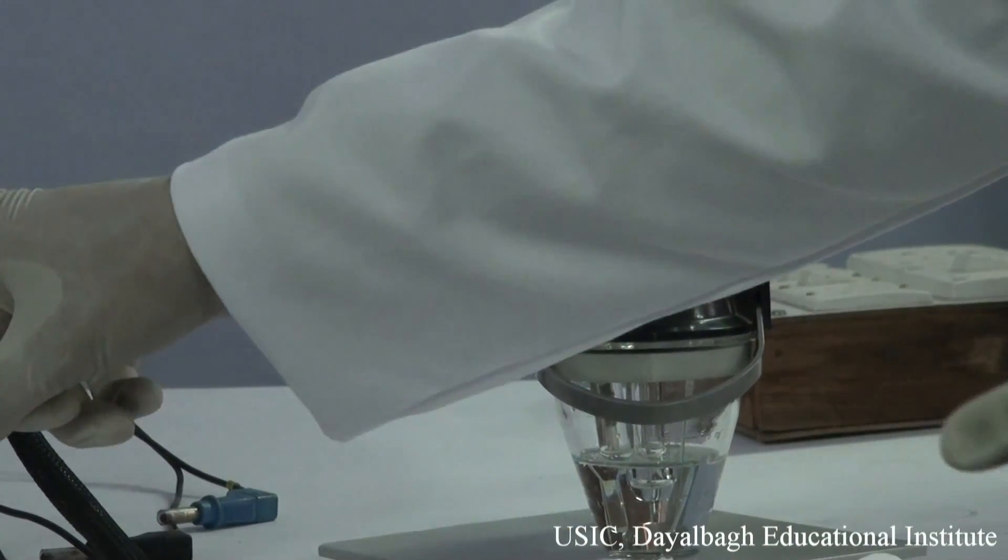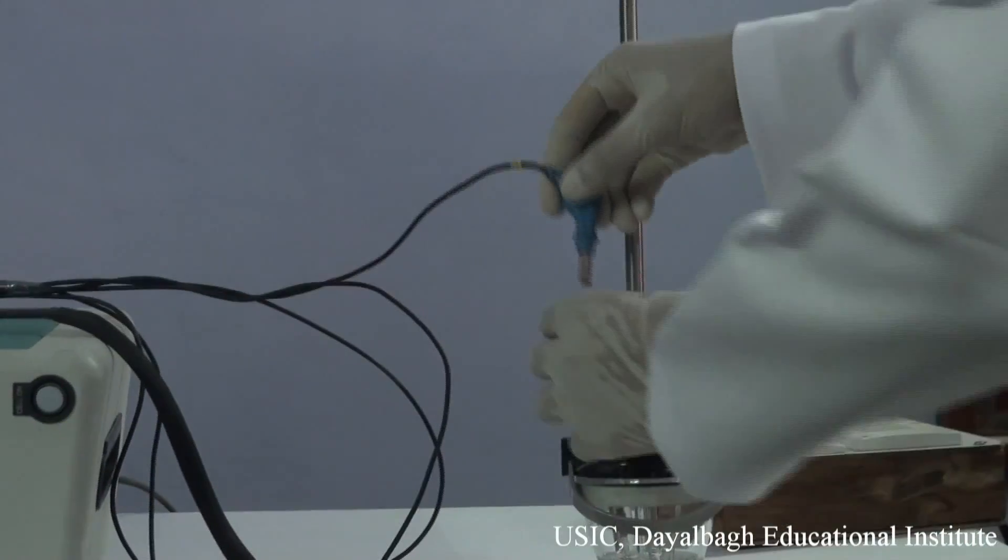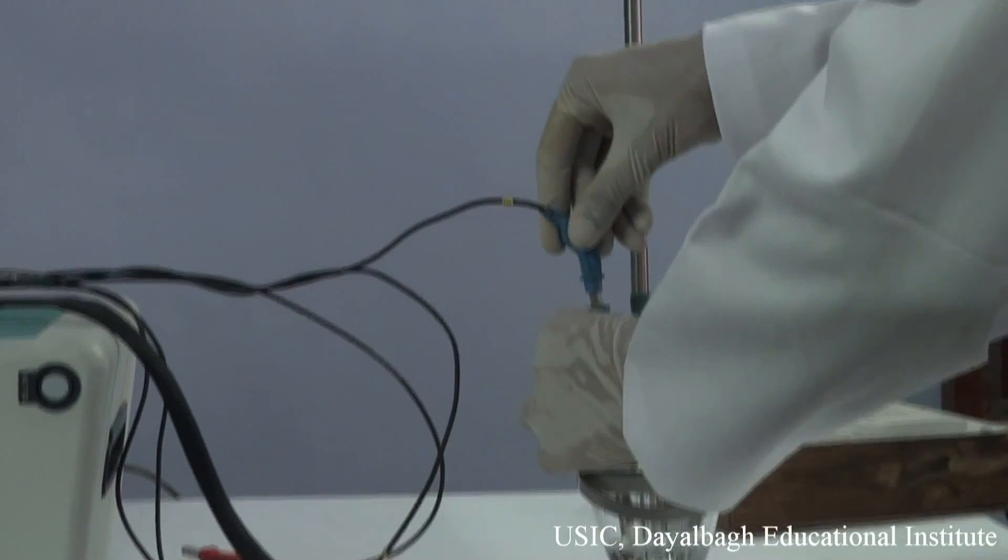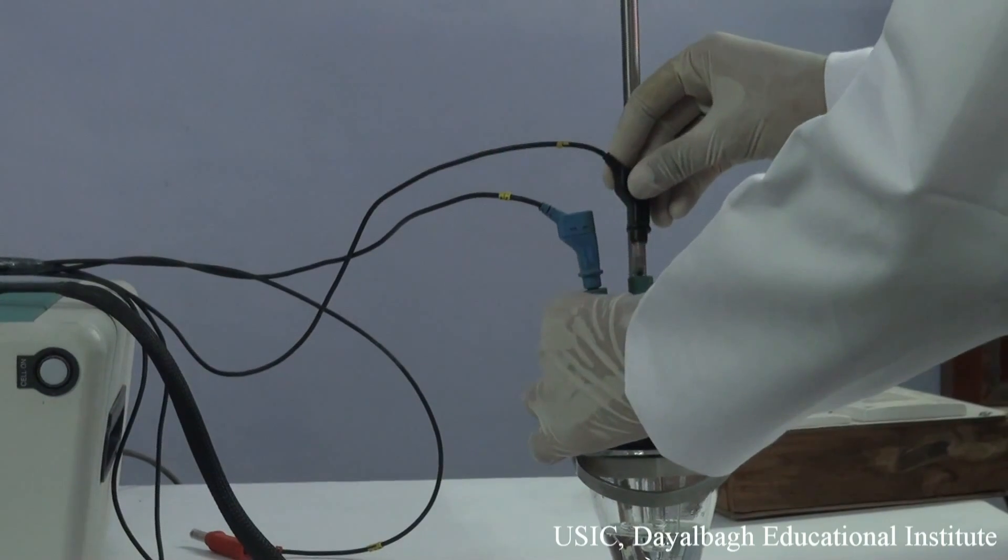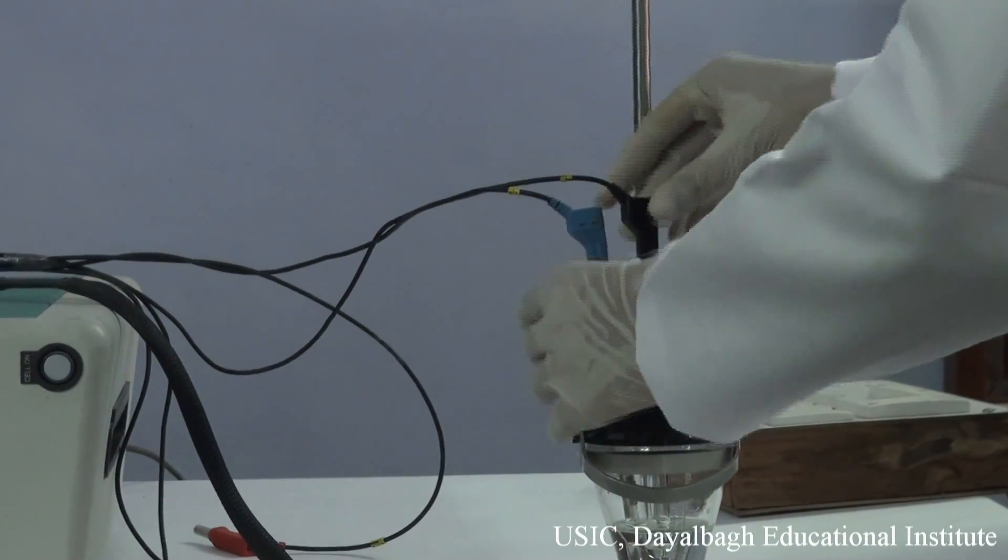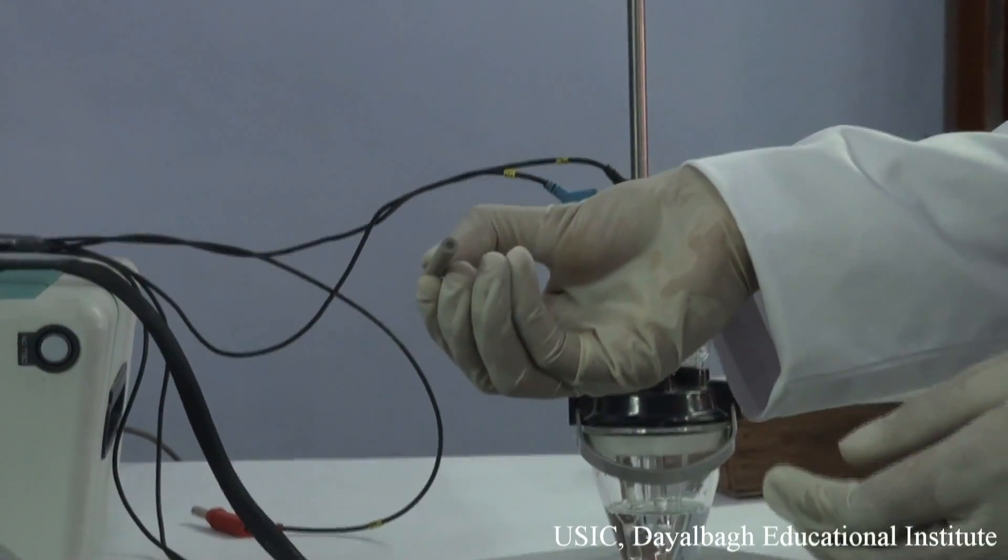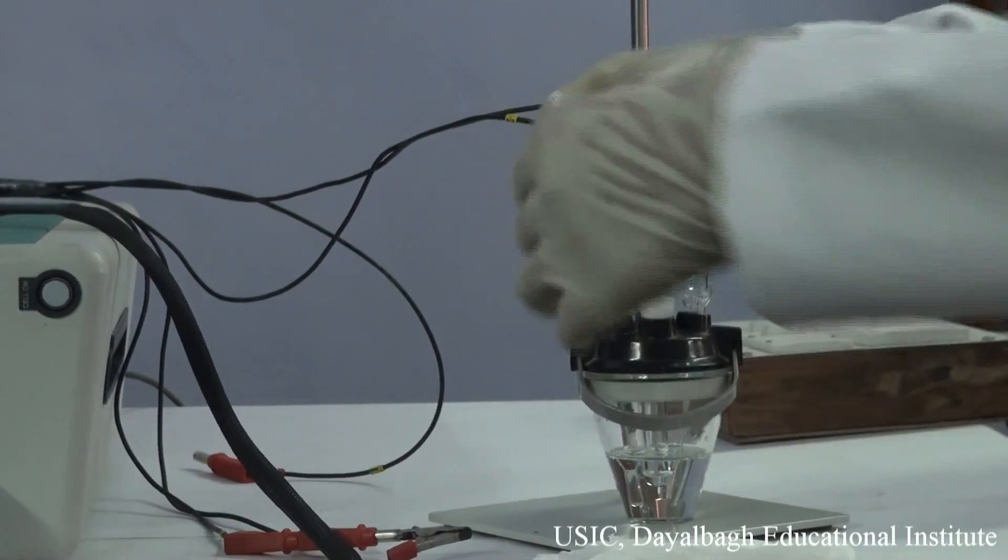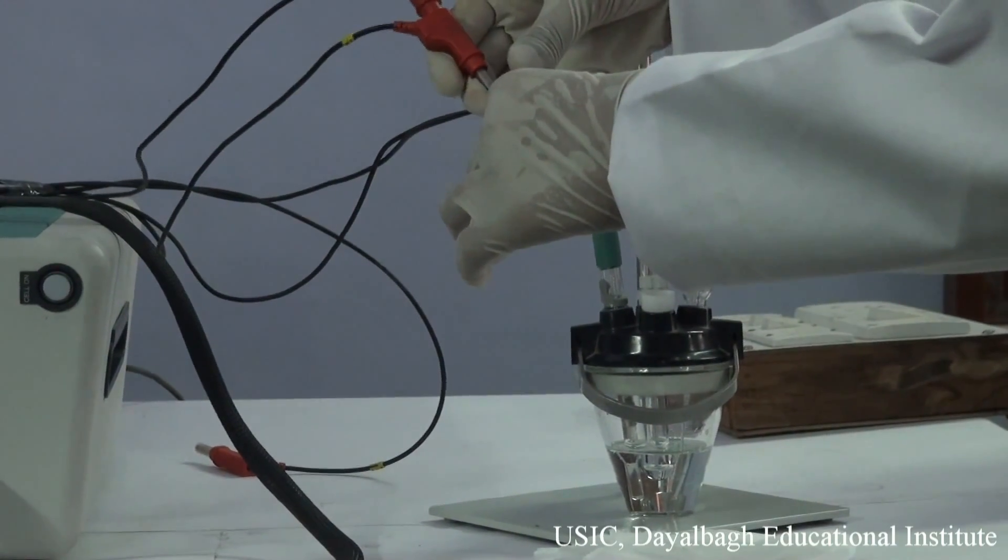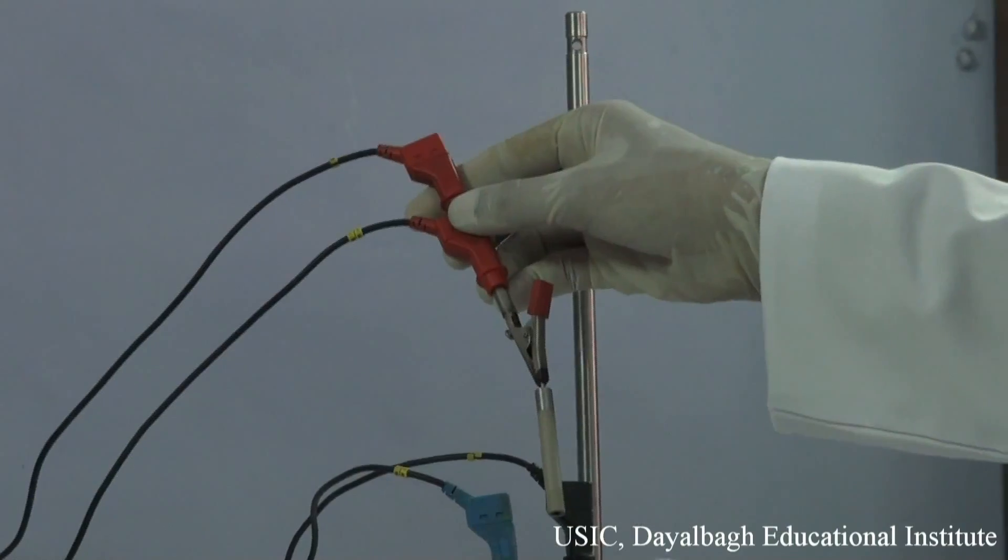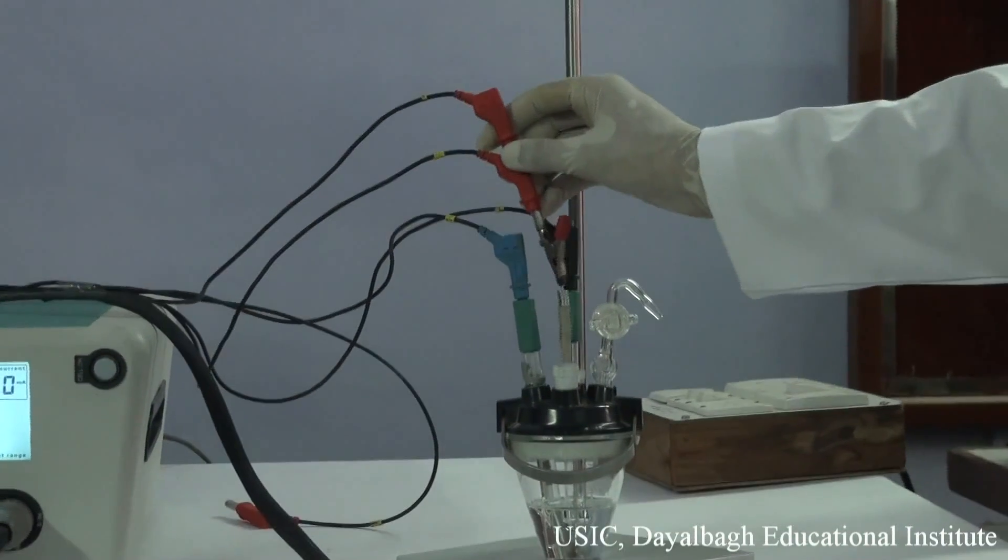Now, we connect the autolab with the three electrode system. This one is for reference. The black one is for counter, the platinum wire. And the working electrode is the boron-doped diamond electrode which has already been activated. We will use the crocodile clip for connecting with the potentiostat. Now, this is the working electrode and we are immersing it in the given water sample.